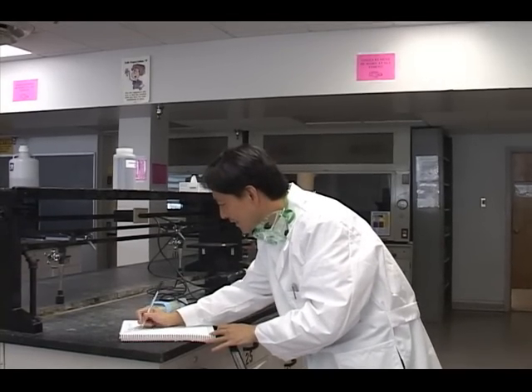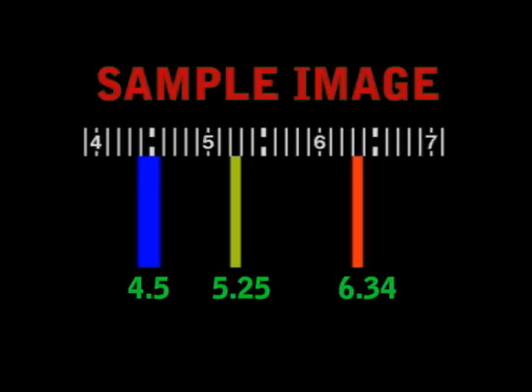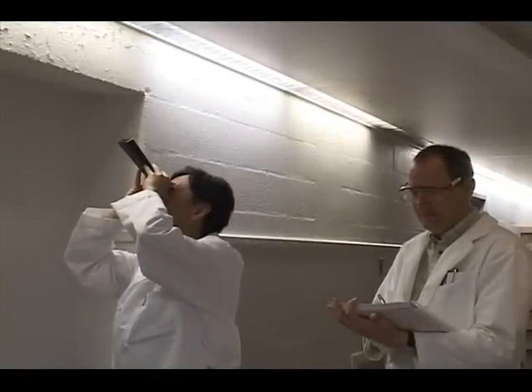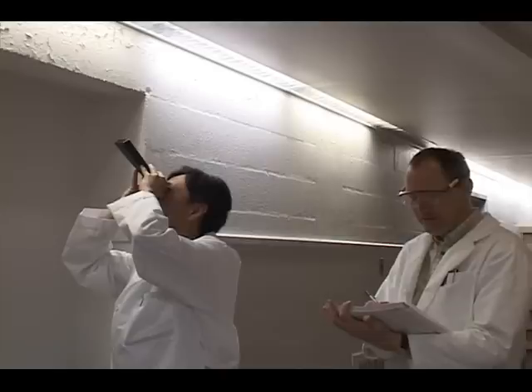Make sure to record the number on the scale under each band of color to the highest precision possible. Also, record the color and thickness of the band. If you don't get a clearly resolved emission line spectrum for the fluorescent lights in the lab, go to the lights directly outside of the lab. They may be closer to your scope and resolve more clearly.